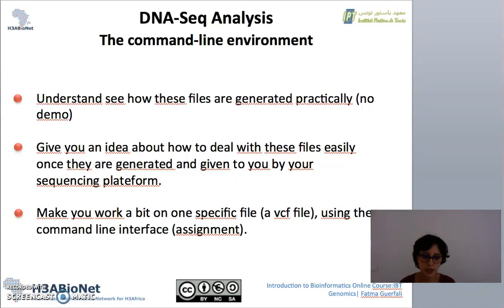So there will be no exact demo for that, but we will be showing you some basic command lines that are used for classical NGS pipelines and some key steps of it, and we will be giving you also an idea about how to deal with these files easily once they are generated and given to you by your sequencing platform. And we will make you work a bit then on one specific file, which is a VCF file, using the command line interface. This will be in the video of the assignment, and it will be useful for the last part of your assignment.